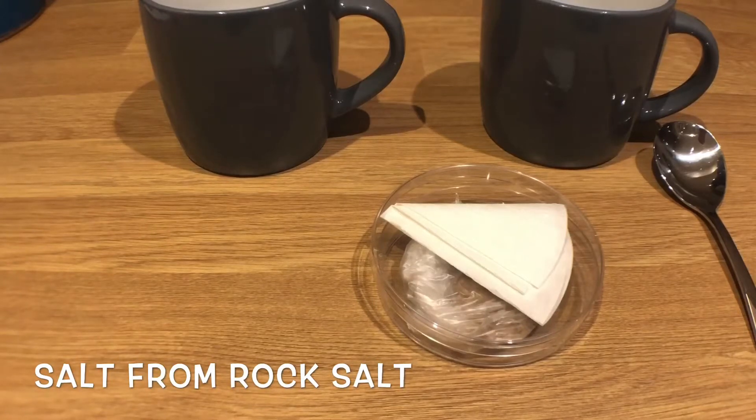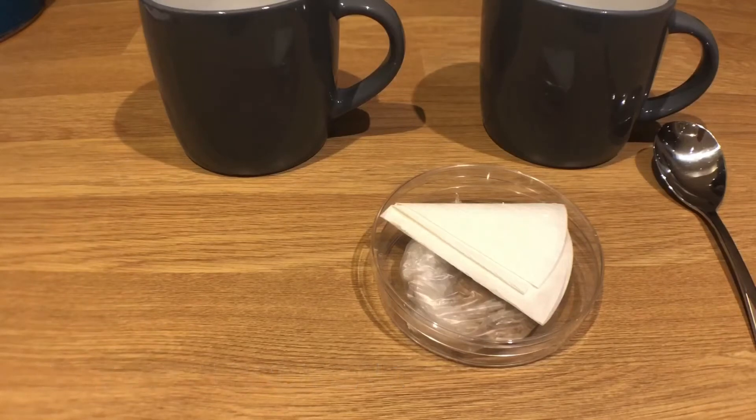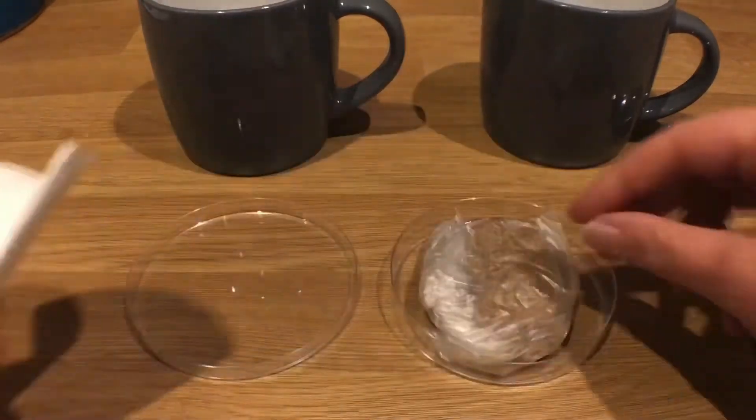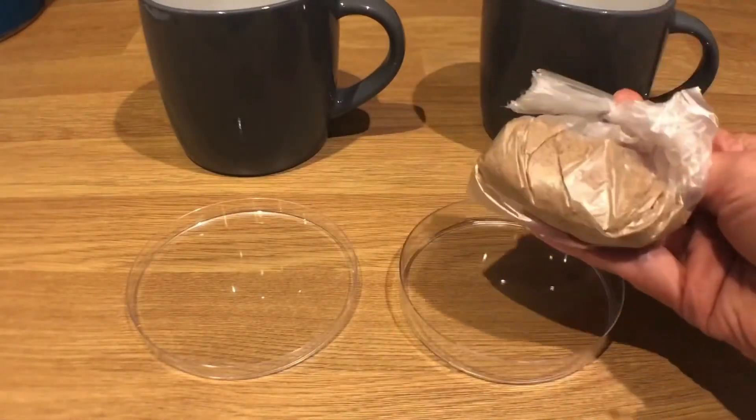Hello Year 7, here I am back in my kitchen for another science practical at home. We're looking at the home learning for the particles topic: separating salt from rock salt. You'll have been given your pack that looks just like this at school. We've got a petri dish with one piece of filter paper and some rock salt.